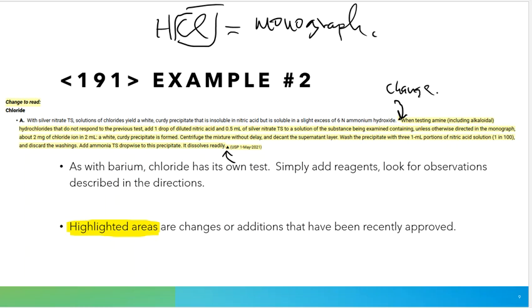Now let's take a look and see what the sentence is. So that way, if you were performing this particular piece of the general identification test, they are letting you know, just double check it, please, because something in here could have changed from the way that you've been doing the test, and we want to make sure that we are alerting you of that change. That's the way they do it. If you're on the online version, sometimes they will also highlight those areas, not just put triangles, to bring more attention to them, but that's what that is all about.